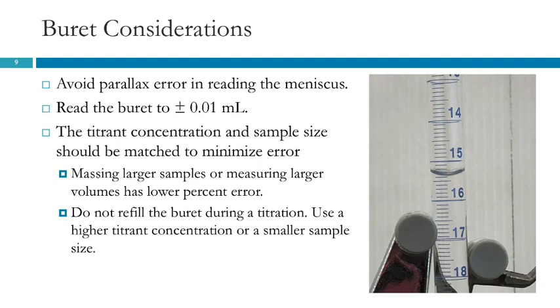But there's information there, and so we should record it. A mistake that students often make is they just go to the nearest tenth. But if you call that 15.3, I'd say it's actually 15.36 maybe, then you are not measuring as precisely as you could. Does that make sense?